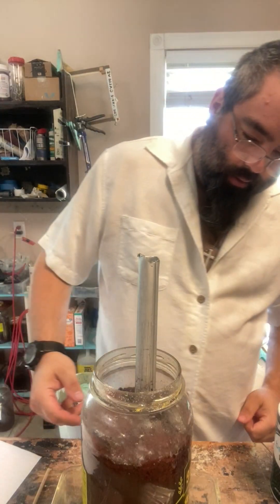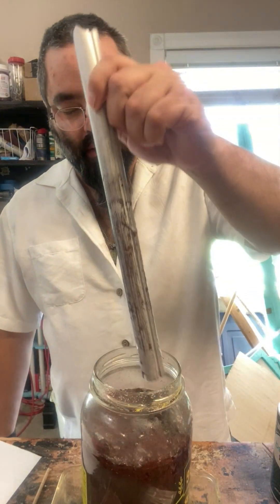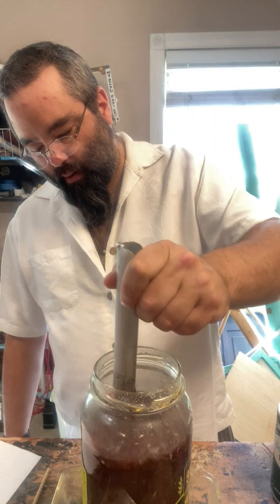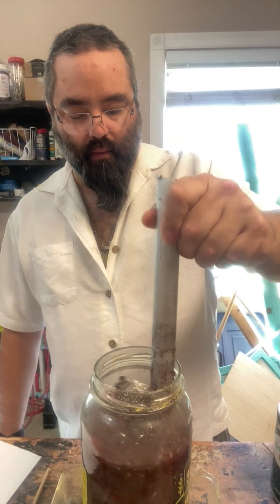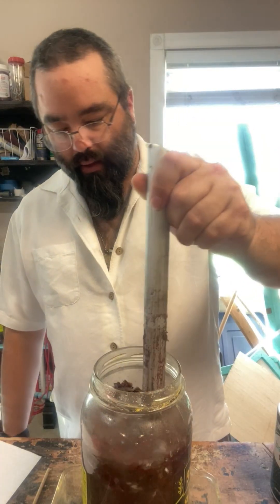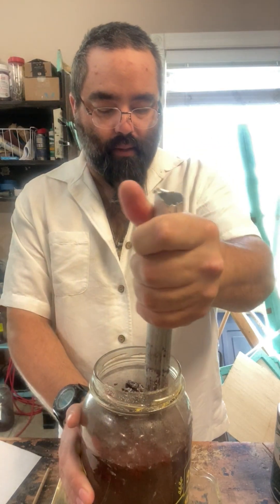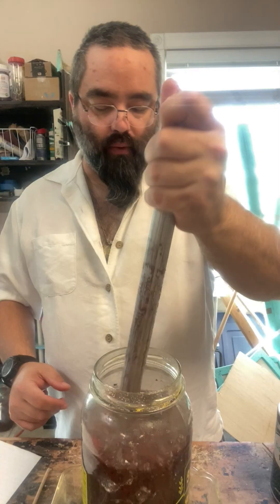We're pretty much past the most vigorous part. There are large amounts of surface area that don't have copper cementing out onto them yet — they will eventually — but we're to the point where it's time to just set it aside and check it in the morning.